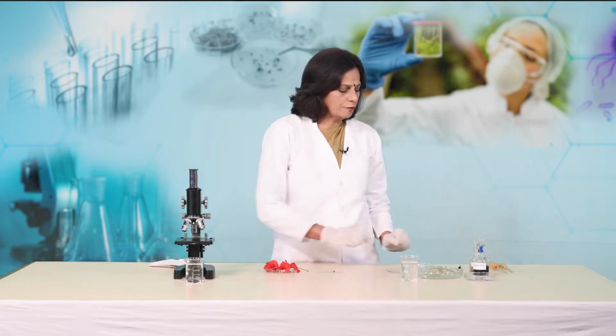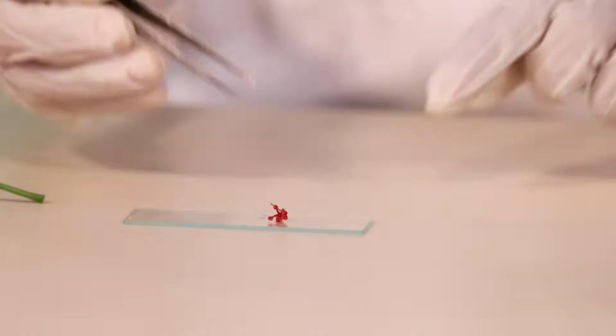We should take measures to prevent over exploitation of experimental material. Now, we will put the stigma and a part of the style in a small beaker containing hot water for 15 to 20 minutes to make the stigma soft. So, this we are placing in the hot water for 15 to 20 minutes.